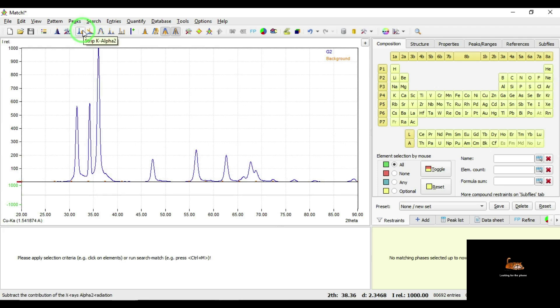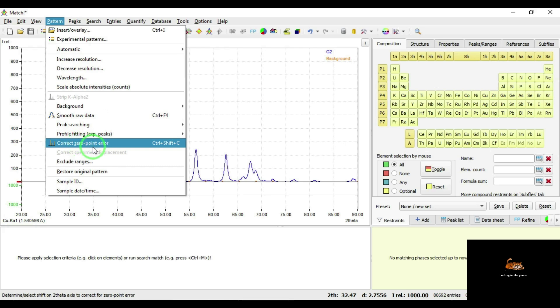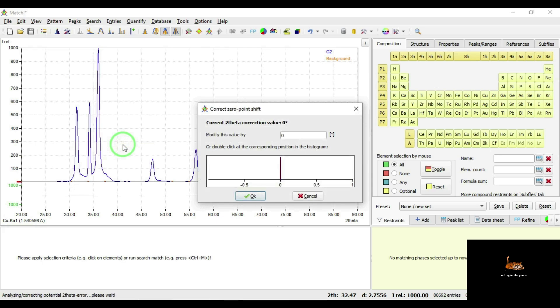The third step is stripping of Kα2 radiation. Most commonly the instrument uses copper Kα1 radiation only, but you can remove the fragments of Kα2 radiation by clicking this button. The fourth step: go to Pattern, where you can see the option to correct the zero-point error. If you have any instrumental error or deviation, you can correct it here. I did not find any error or deviation, so I will not be selecting this one.